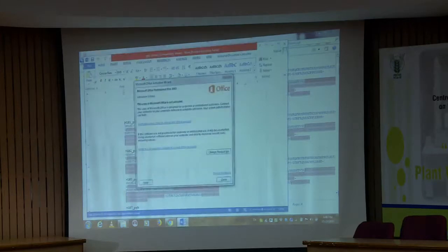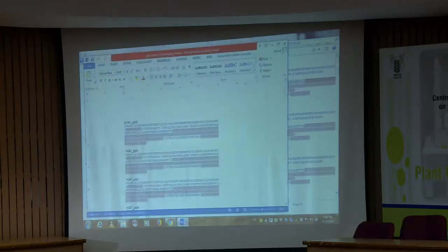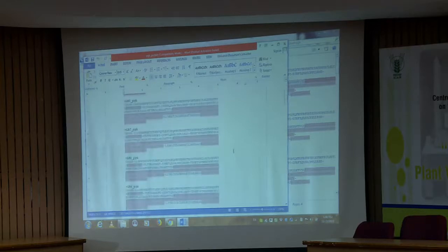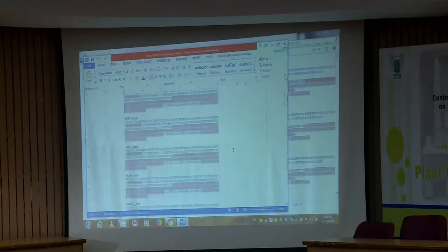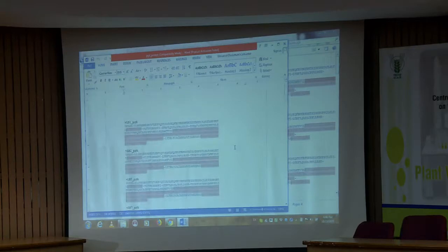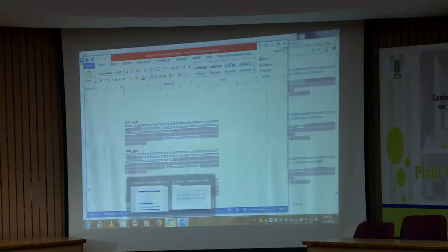Likewise, like I had shown you that nucleotide file, similar way this protein file also, for each sample, sample number 1, 2, 3, 4, 5 and the primer name I had kept, and everything I have pasted here. So, what you have to do, there is also some editing required over there.